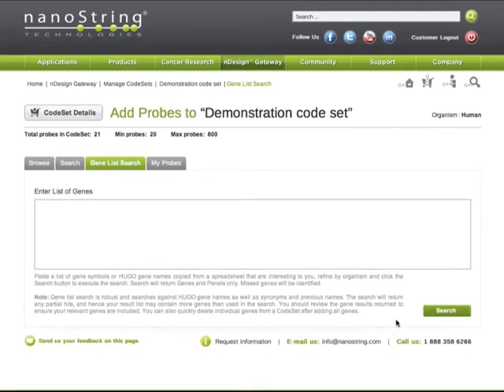So now that I've started a gene list using some genes I'm interested in, I might want to explore what other genes I might want to order for my study. I'll start this by selecting the Browse Genes tab to browse based on the different classifications that nDesign provides.